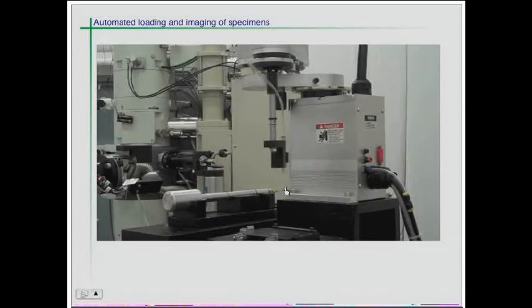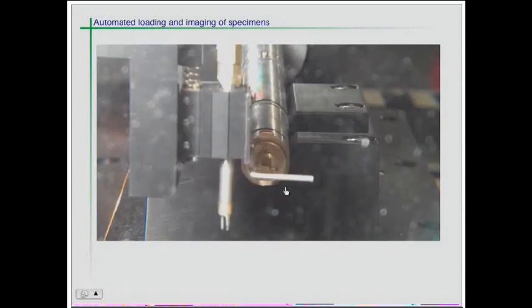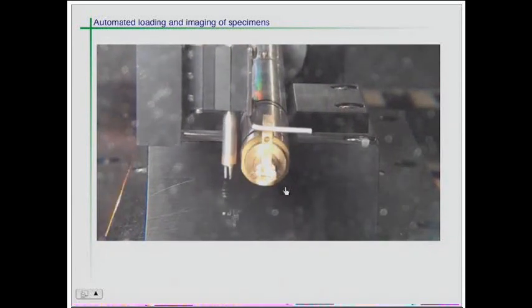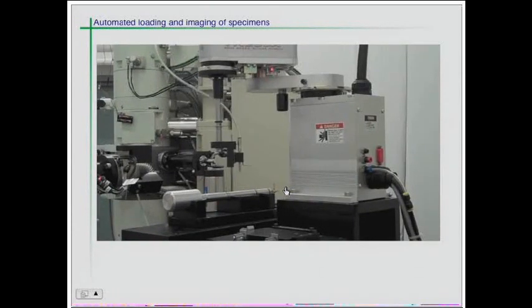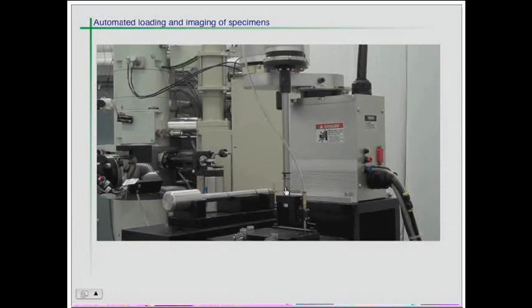This is a movie of the robot. So the SCARA robot is now going to open the clamp. It's going to pick up a grid.